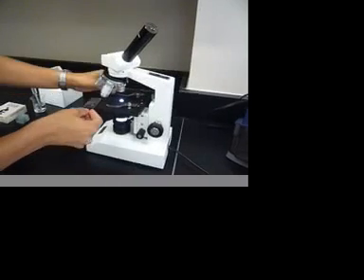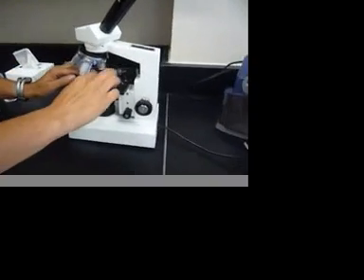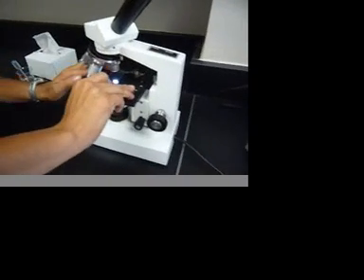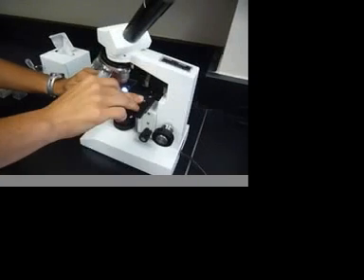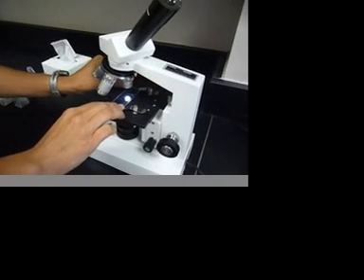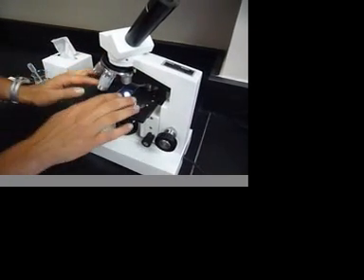Take the slide and you're going to place it under the stage clips. Try to center it so that your object is in the middle of the lens, and the light should be coming up through it.